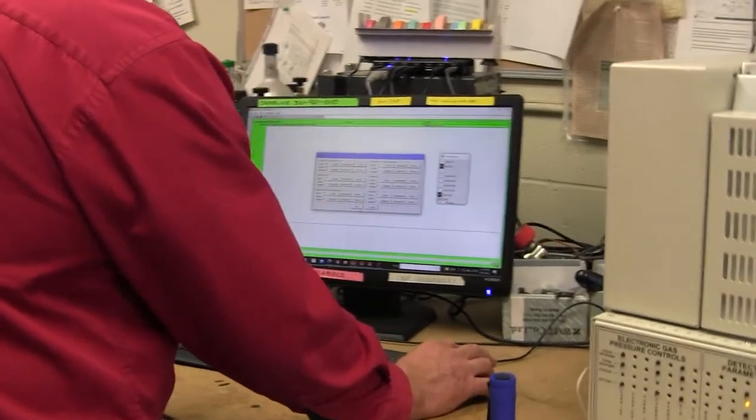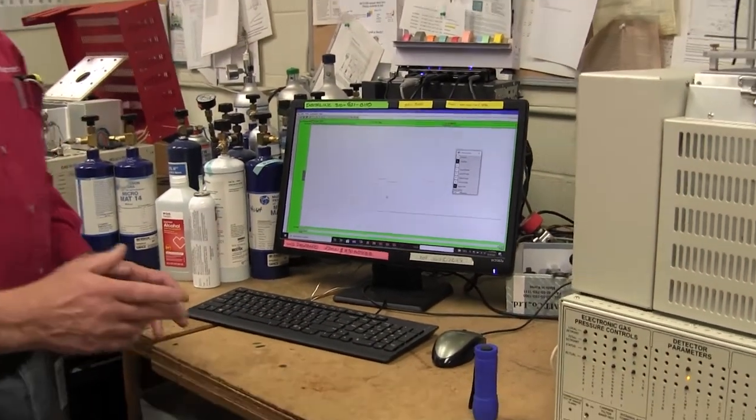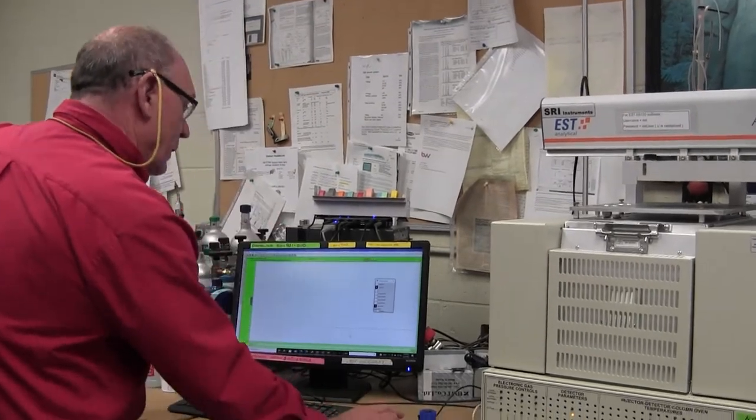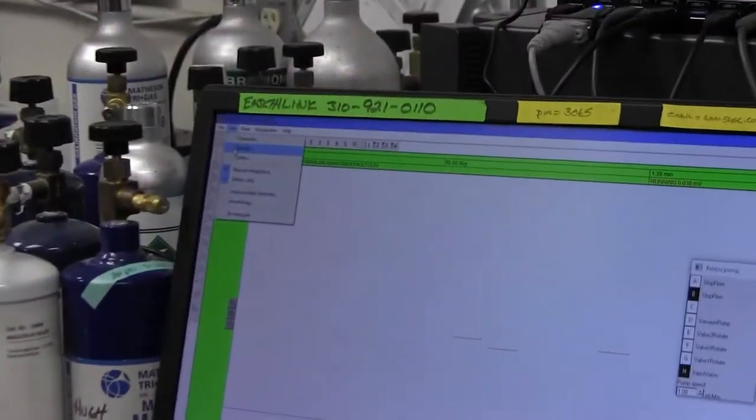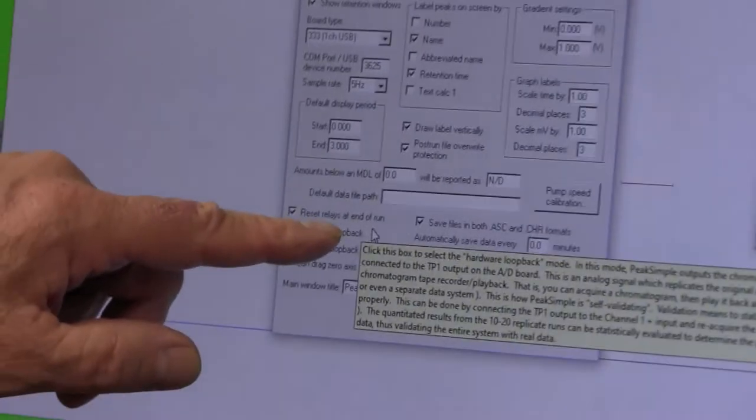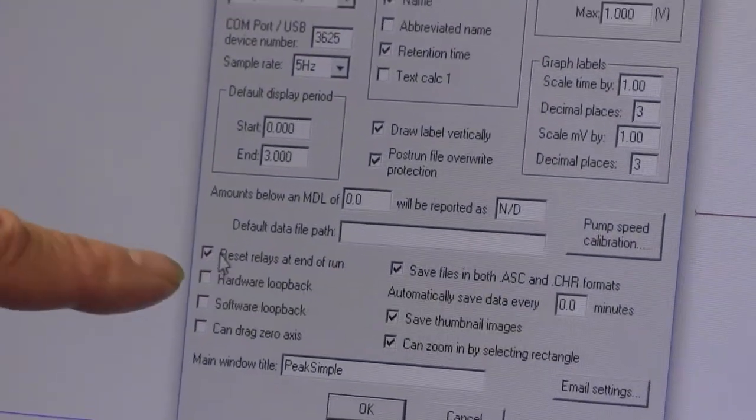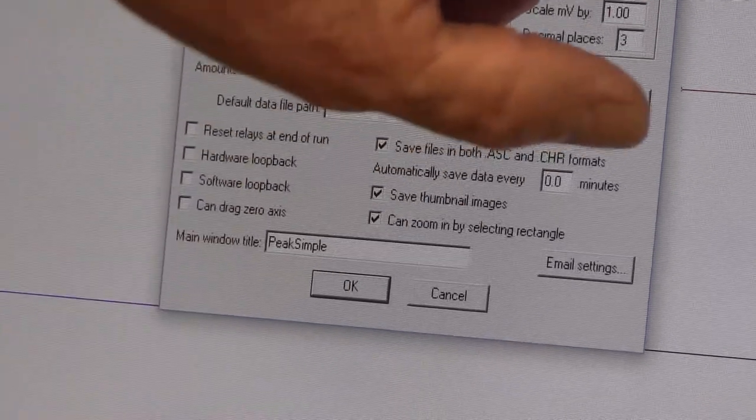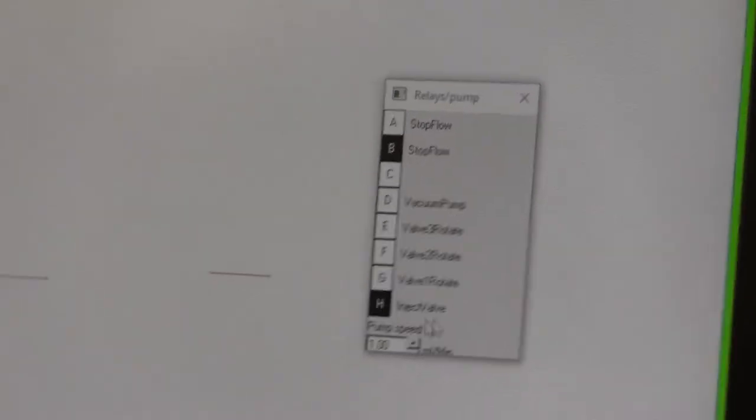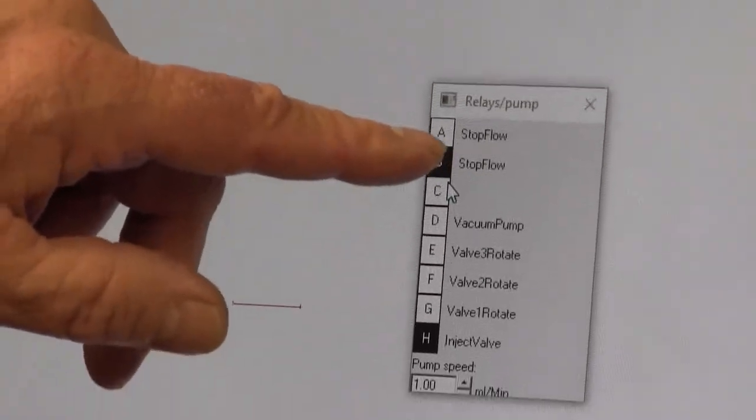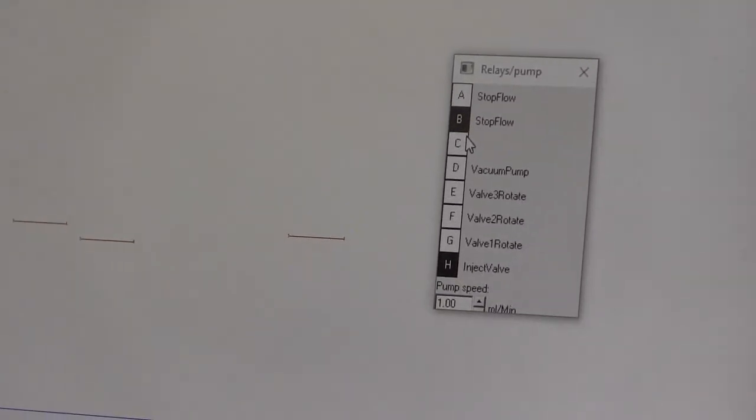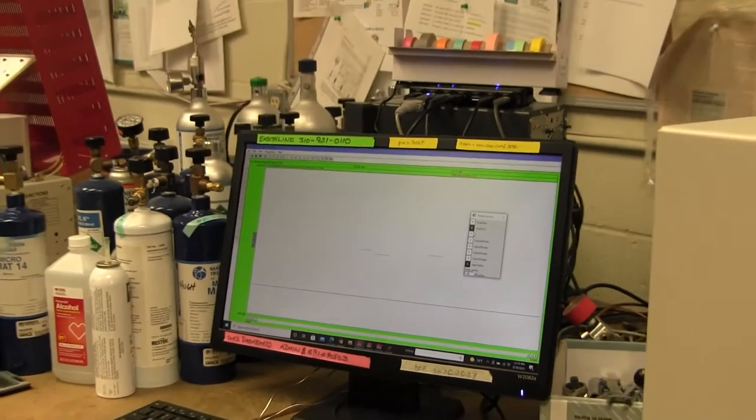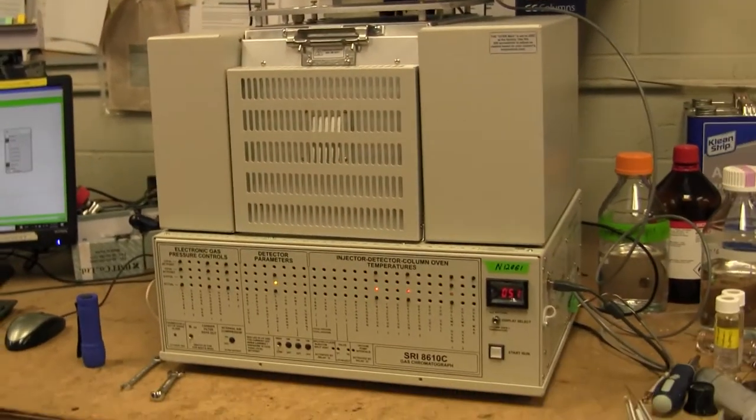So we have to do one more thing in the PeakSimple software and that's we have to go to the edit overall screen and there's some check boxes here, one of which says reset relays at end of run. So the software when it comes downloaded, that check box is defaulted on. So what would happen is unless you uncheck that box, these relays would turn off automatically at the end of the run. Now that wouldn't be a problem for relay H but for relay B that would be a problem because then the next sequence wouldn't start. This is like the permission button. If that's off, then the auto sampler doesn't have permission to begin the next cycle.